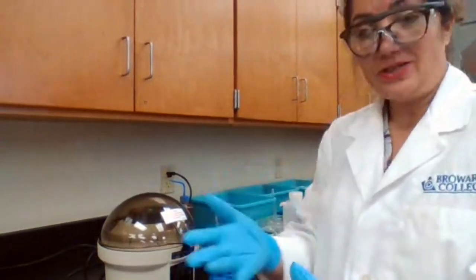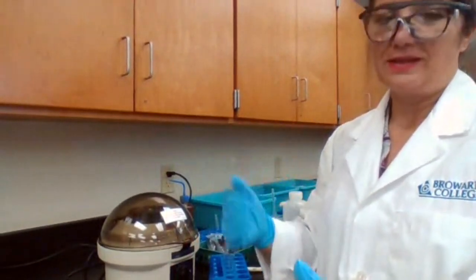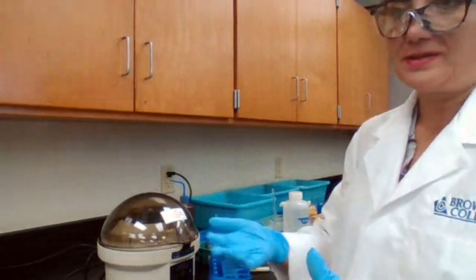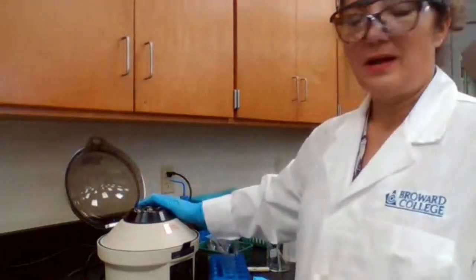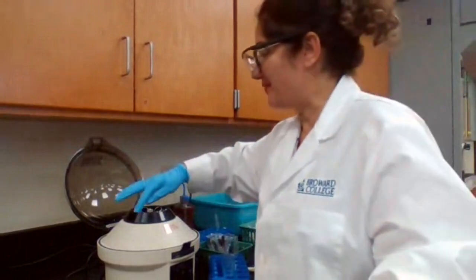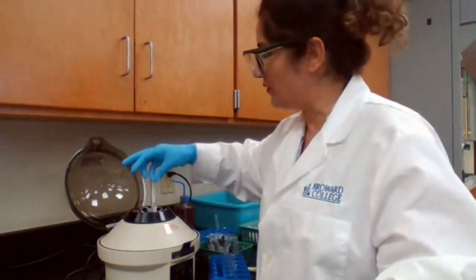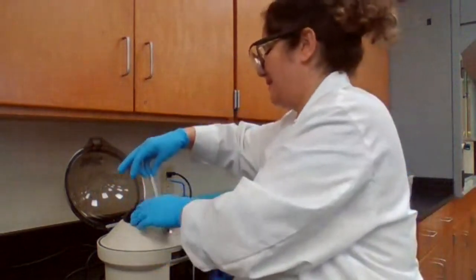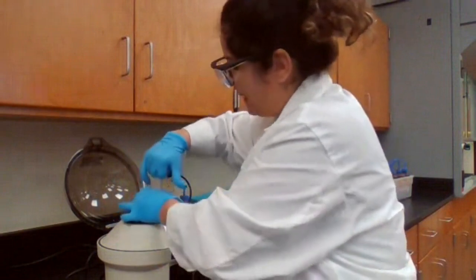But for titration, when you are using a burette and pipette for exact measurement, 2 drops will make a difference in the concentration of the unknown. Here we're not trying to find how much of each ion we have. Qualitative analysis is just the presence or absence.